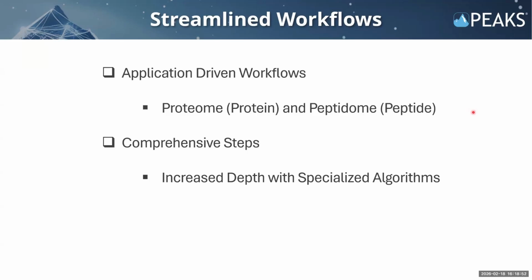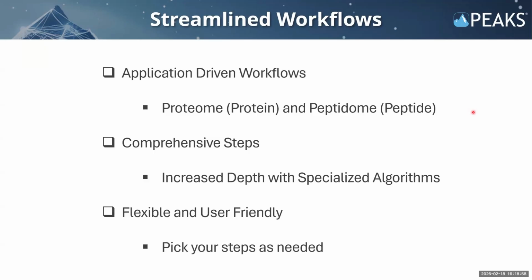And we have many comprehensive steps with specific specialized algorithms for each step. As well as, I'd like to say, we are very flexible and user-friendly, so you can actually pick your steps really as needed. So if you want to perform a database search and then maybe later you want to modify and add an LFQ, you can always go back to your previously run analysis and add another analysis to it later.